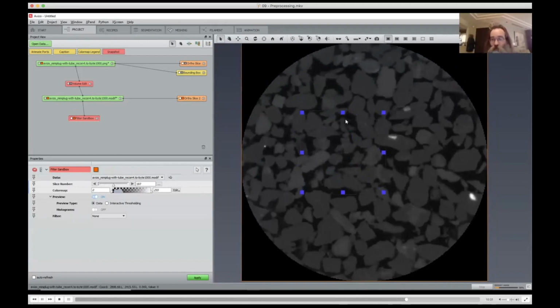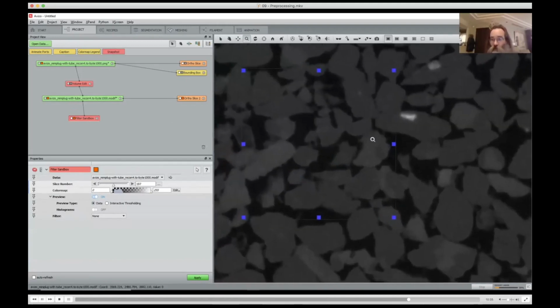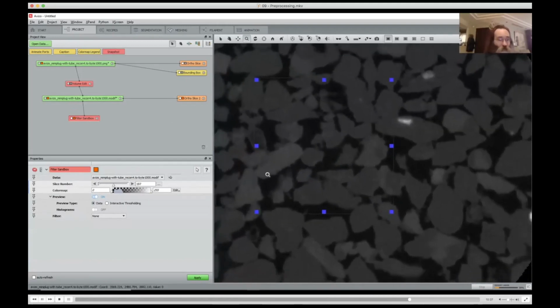And then, let's zoom it a bit more now again. And then you can choose a filter here, and you have a choice of a few ones here. And you get a fast preview within this region, and the outside it will not apply the filtering. So you actually have a nice way to compare how your filtered data looks in comparison to the original one.